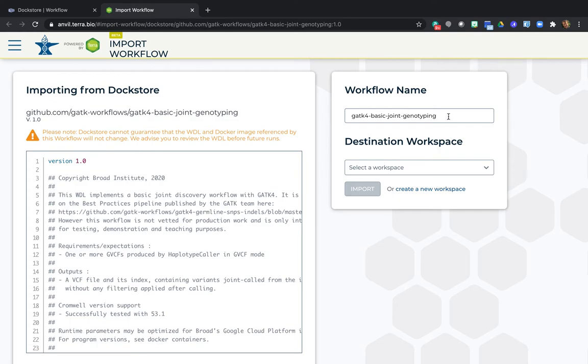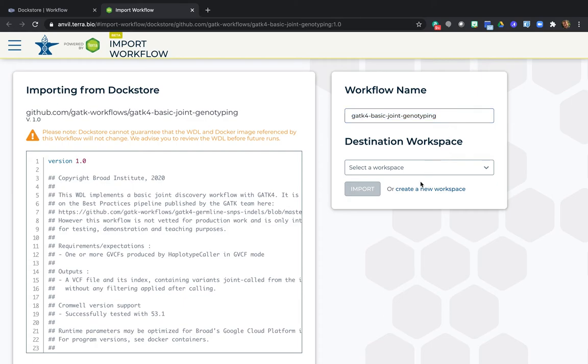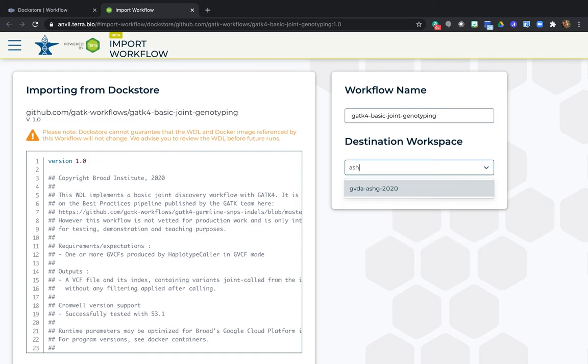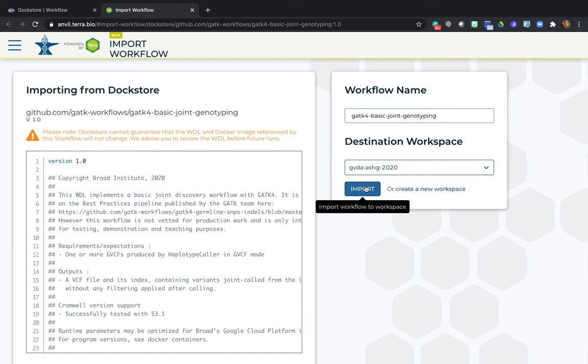By default, the system suggests importing the workflow under the same name as it is in Dockstore, but you can change that to whatever you want. You'll need to choose whether to create a new workspace or select an existing workspace. At this time, unfortunately, the system does not remember what workspace you were originally coming from. So I am just going to start typing the name of my workspace until the list is narrow enough that I see the one I want. I click on it, I hit Import.